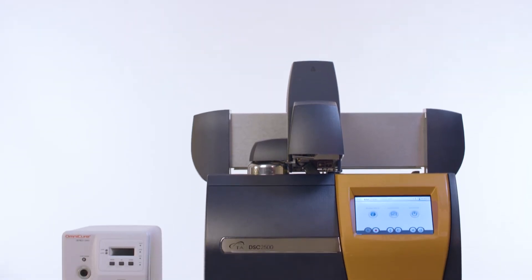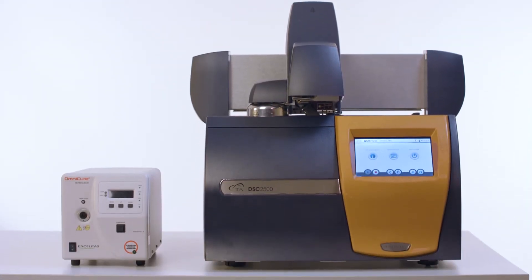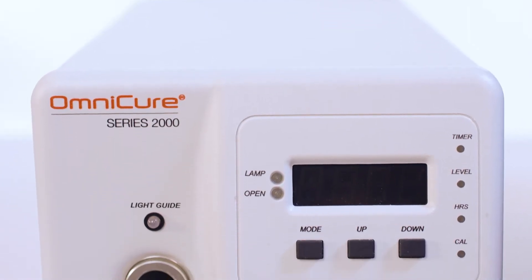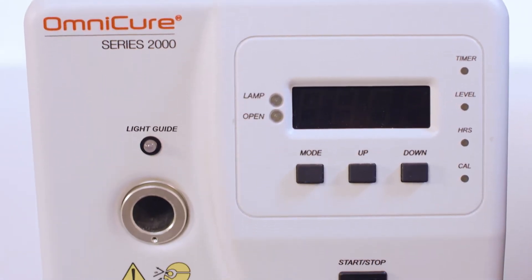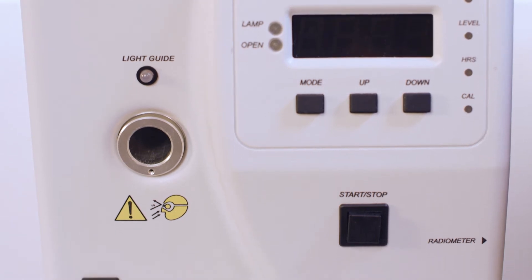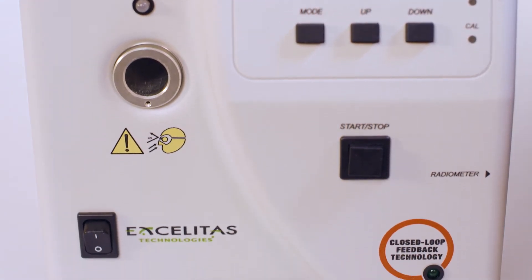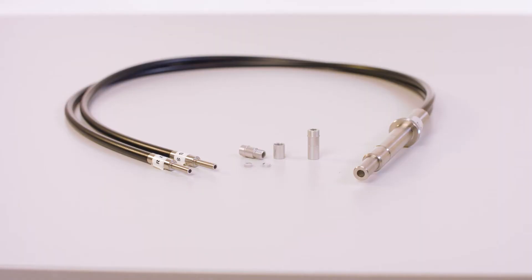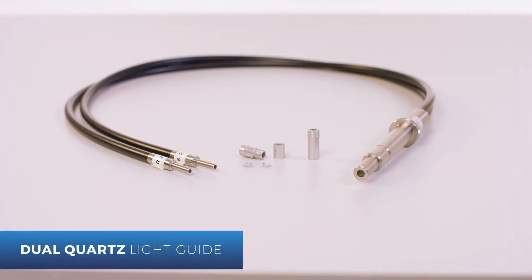The photocalorimeter accessory PCA is used with TA Instruments Discovery DSC. The accessory allows samples to be irradiated with UV or visible light inside the DSC cell. The UV or visible light is transmitted from the light source to the DSC cell via dual quartz light guide.